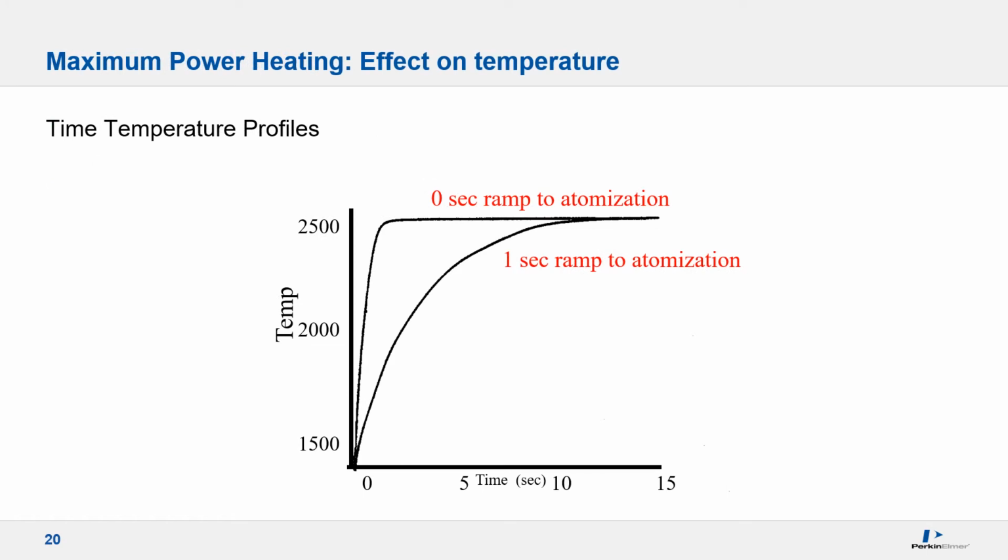By increasing the temperature of the furnace at the maximum possible rate during atomization, the tube wall and surrounding argon are heated much faster than the platform, thus ensuring a stabilized tube temperature at the time of analyte volatilization, as shown above. This helps to ensure that this desirable, stable condition will be established before the release of even the most volatile analyte forms. The release of analyte atoms into the same furnace environment for all analyte forms is the prerequisite for elimination of non-spectral interferences.